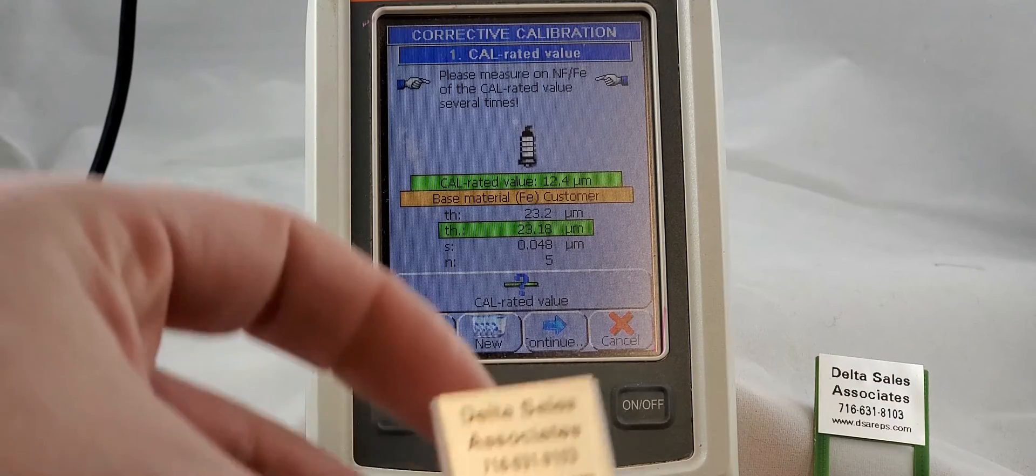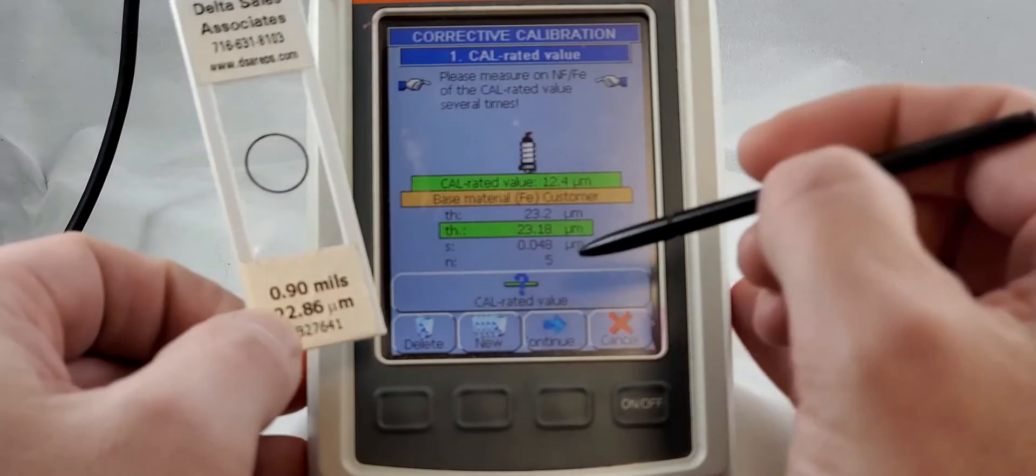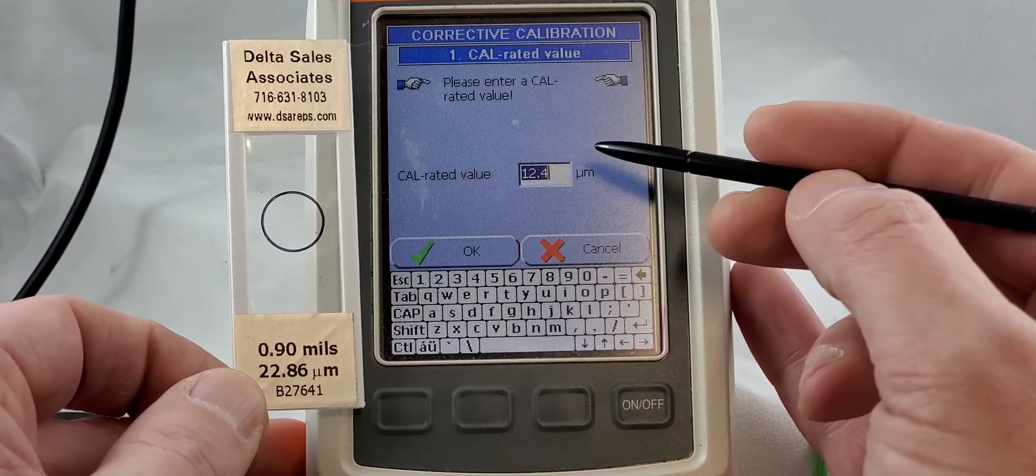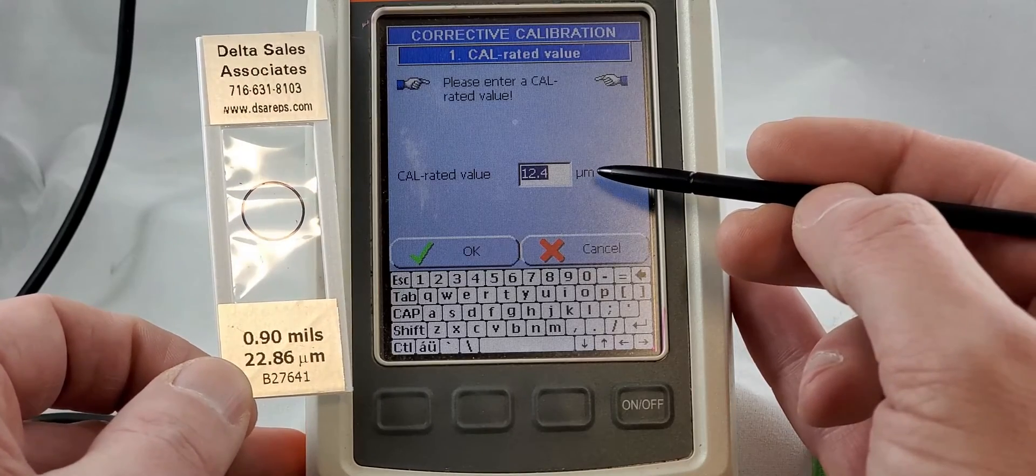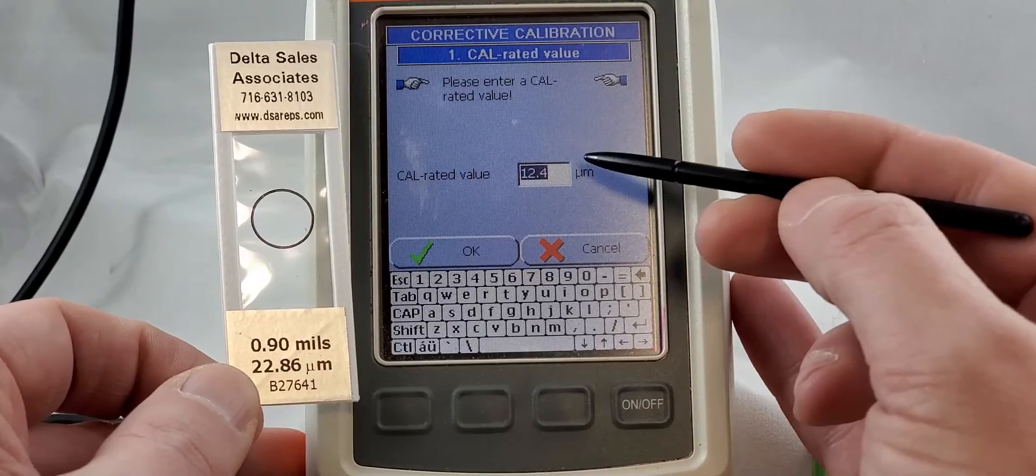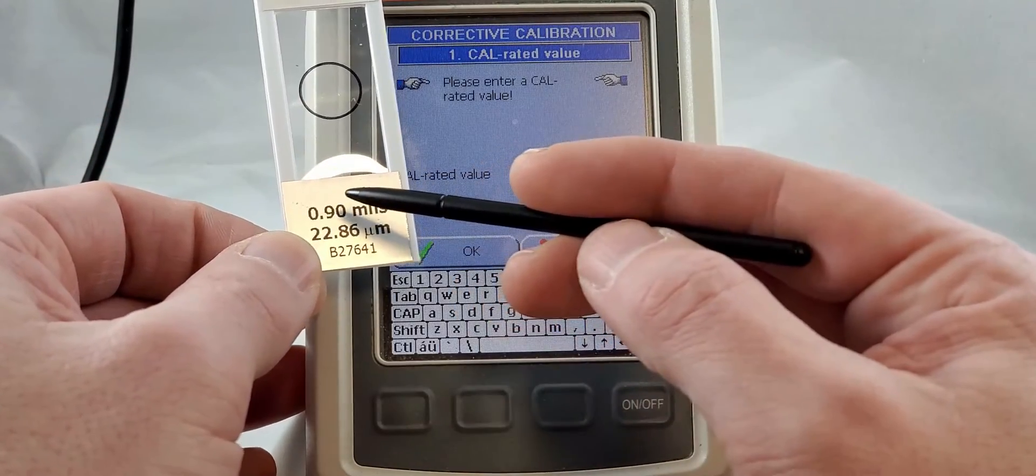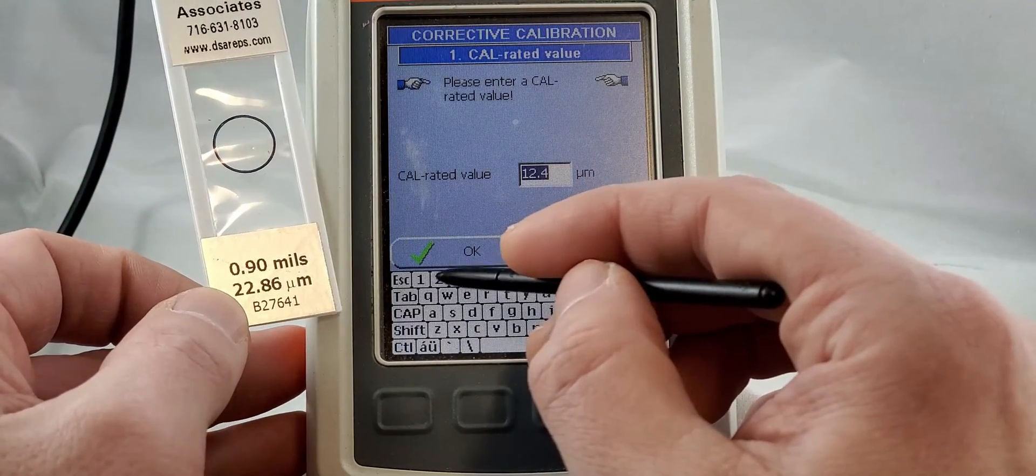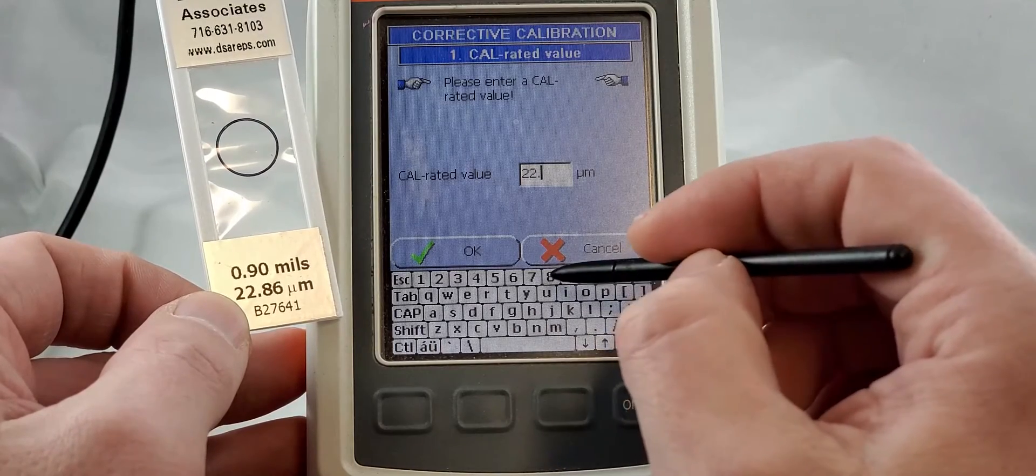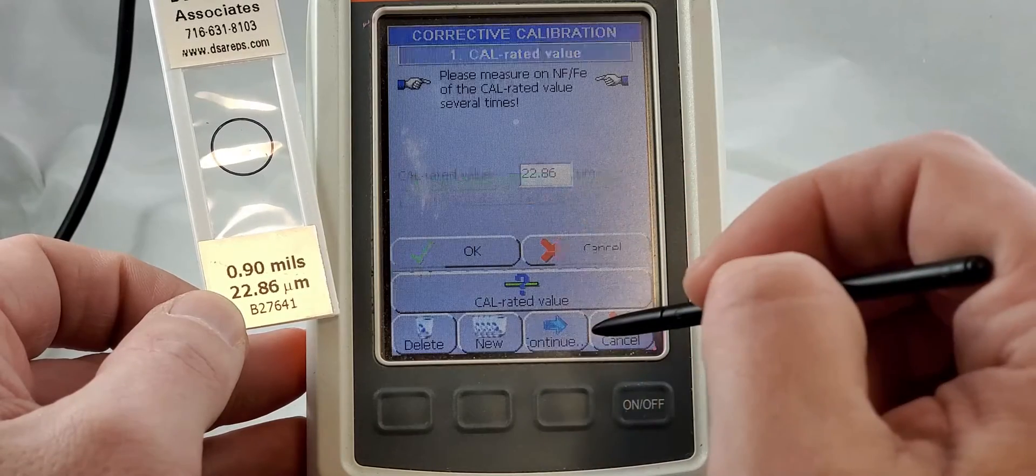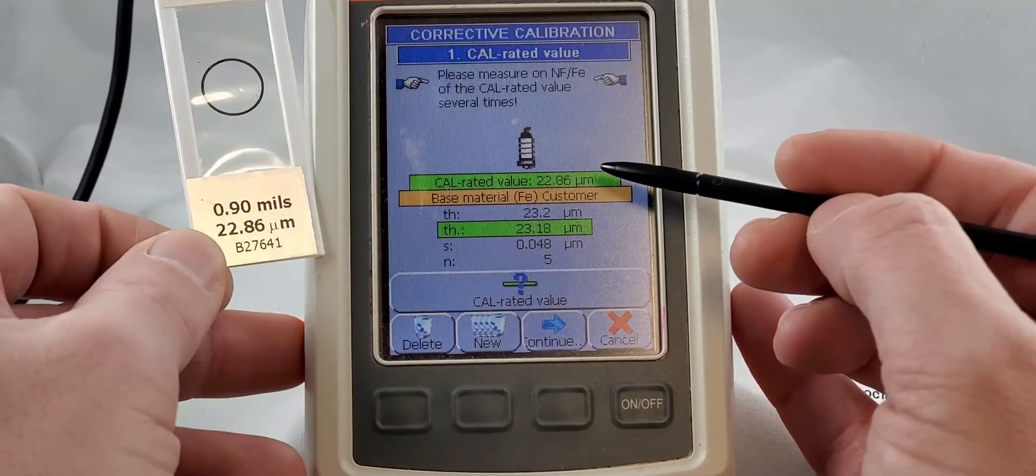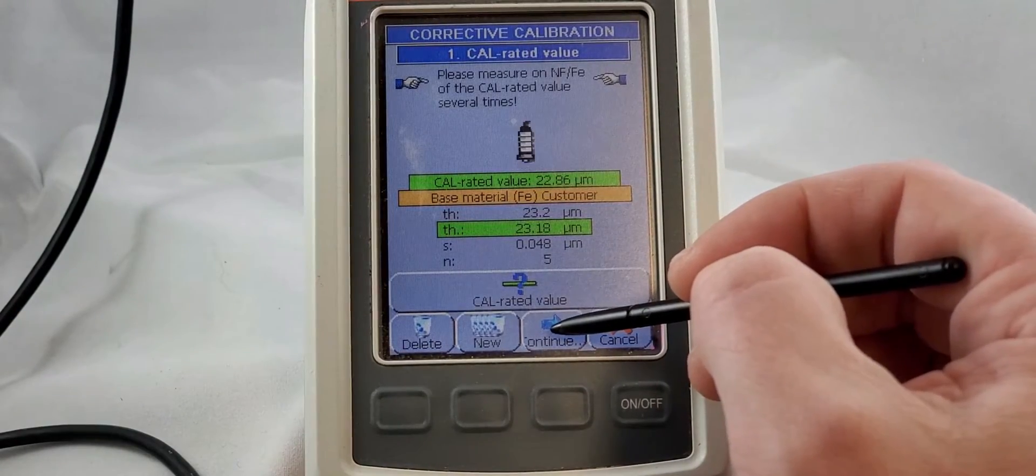Now we have our foil and we are going to hit cal rated value. We are going to check our unit value. You always, always, always want to make sure that the units you have programmed in here are going to be the units that you're selecting the value for. So we're in microns. We're going to take the microns and simply make this value equal the value on our foil. Okay, so now we've taken our five measurements. We've made sure that the cal rated value is the same. We are going to hit continue.